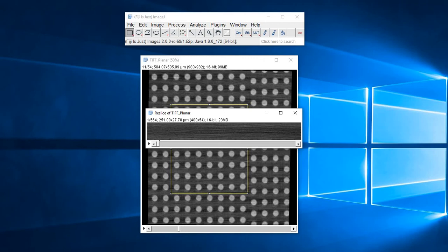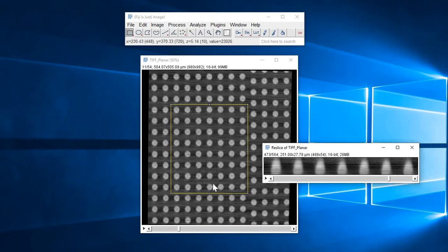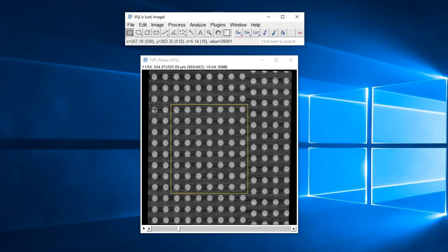As you can see, it has generated another 564 new slices, and if you go slice by slice, you can see that it took all the particles here and created a new number of slices. For comparison, you can see that there are only 7 particles here, and here also 7 particles. So this is one way to slice and keep whatever you want to keep from a stack of images.